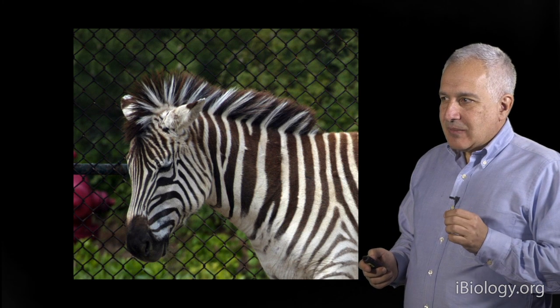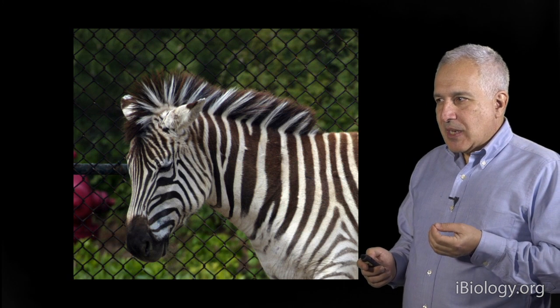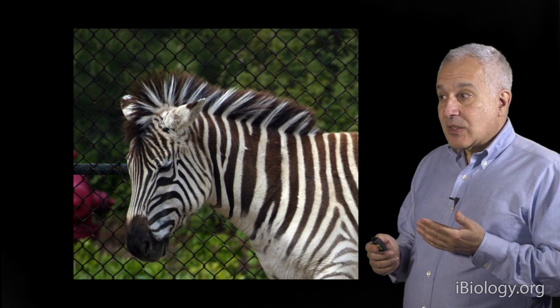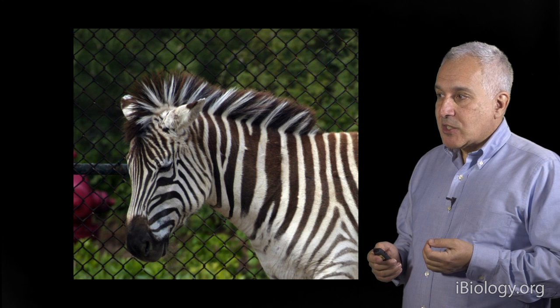So aliasing, this kind of problem of lower resolution, is not just that things are fuzzy, but it generates areas of light and areas of dark that are artifacts. And this can severely crimp your ability to interpret an image. So that's why I'm spending so much time with this.